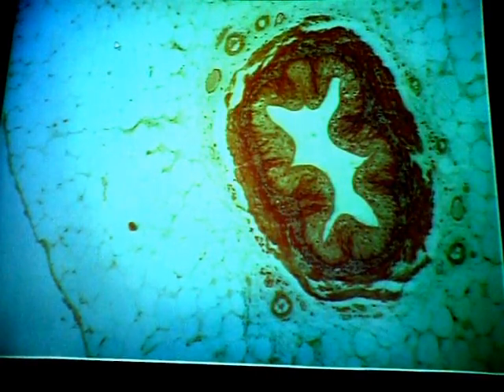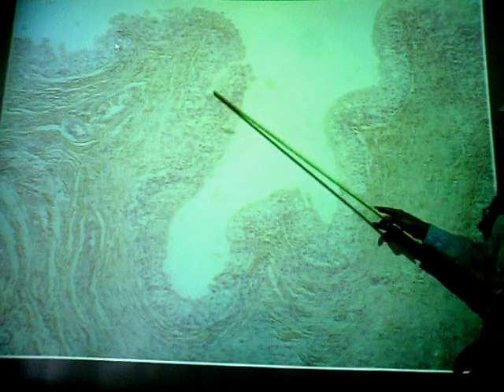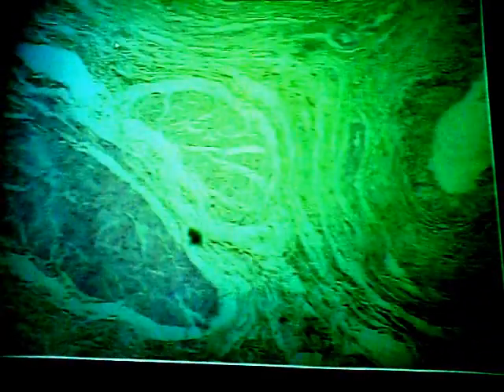Let's look now at the wall of the urinary bladder. And again, we're going to see the same layers. The epithelium that we saw in the ureter is the same as what we see in the urinary bladder. Now you can see the wall is still in folds because there's no pressure on it. This lavender color here, that's the epithelium, and again, it's transitional epithelium. This pink stringy stuff deep to it, again is lamina propria. That's that loose connective tissue.